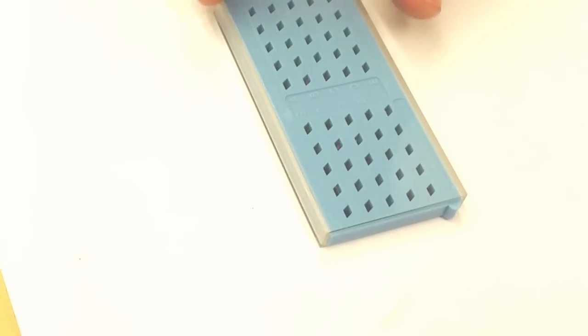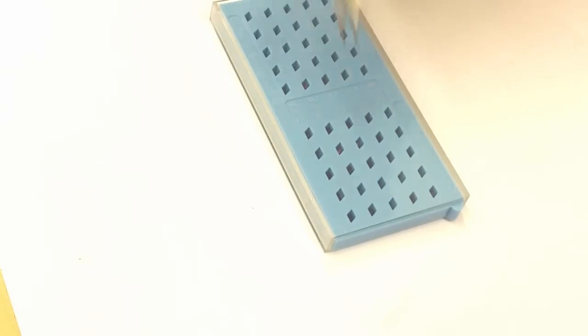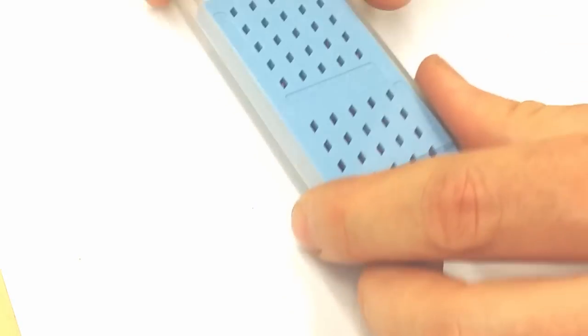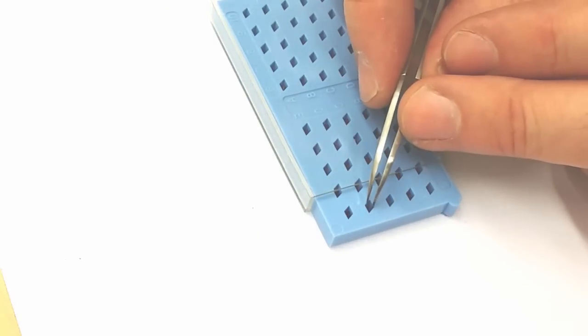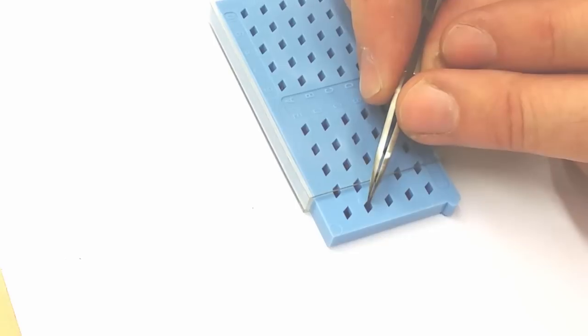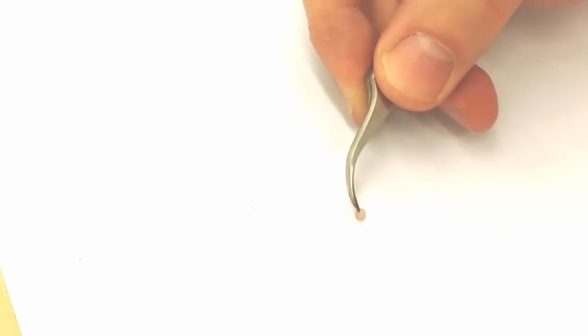When you do TEM analysis, you usually put your samples on small metallic grids. And these grids you buy and they usually come in a box that looks like this. So here you have several small holes and in each hole there is a small little of these metallic grids. If you open the box then you can pick up one of these and then you can see that it looks sort of like this. Very very very tiny little dish that this dish is sort of 3 mm across.